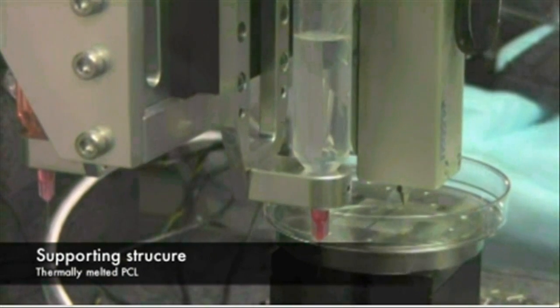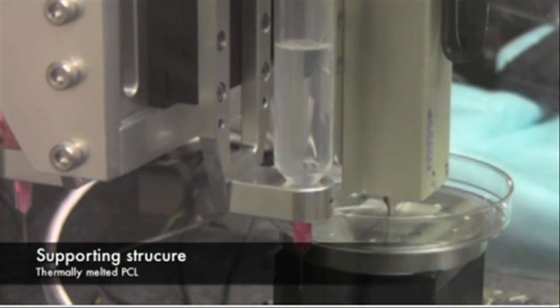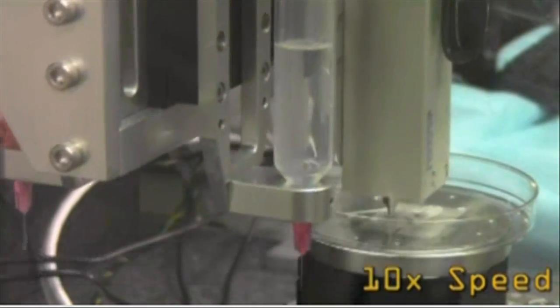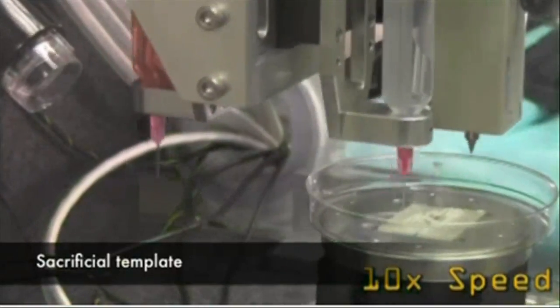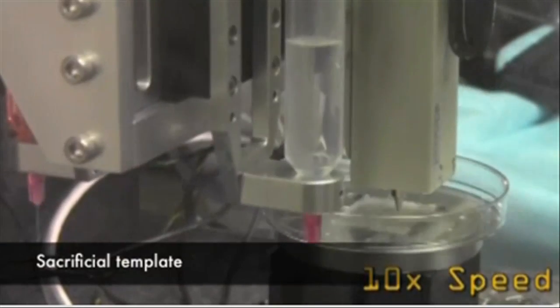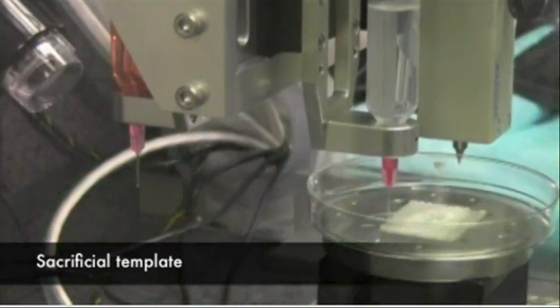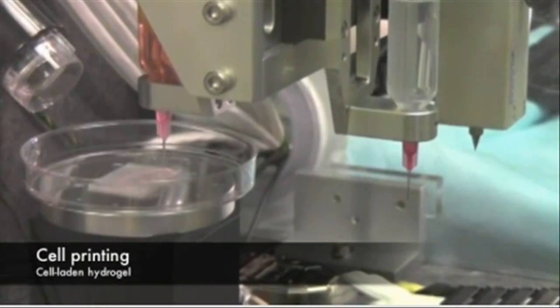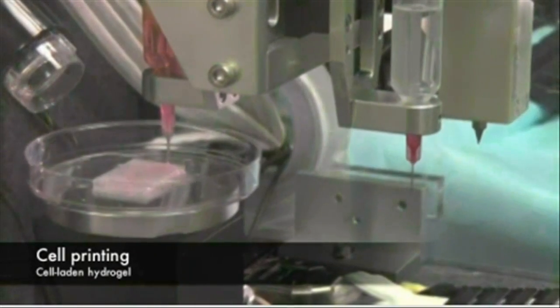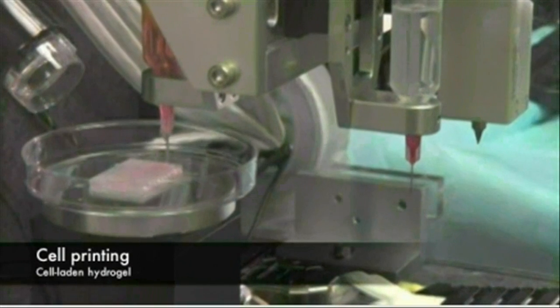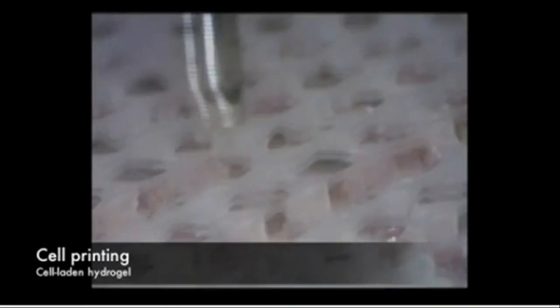Several proof-of-concept experiments demonstrated the capabilities of ITOP. To show that ITOP can generate complex 3D structures, printed human-sized external ears were implanted under the skin of mice. Two months later, the shape of the implanted ear was well-maintained and cartilage tissue and blood vessels had formed.